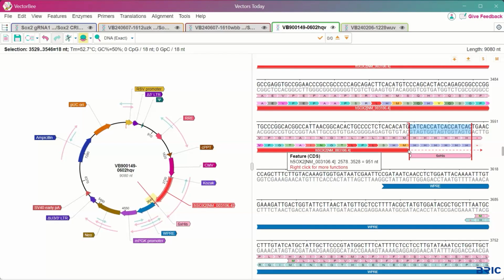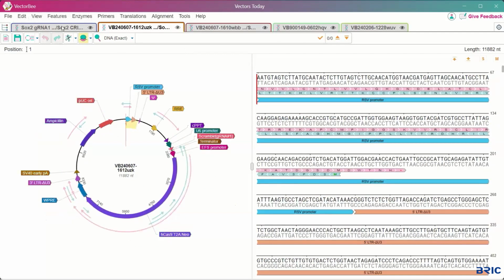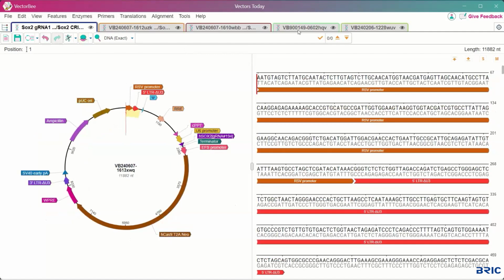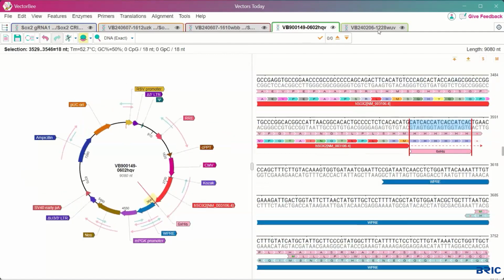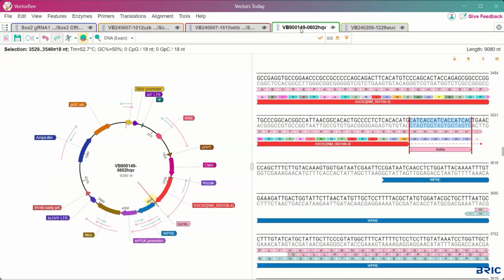Best case scenario, you start looking at your various different restriction enzymes that you have in the lab. You also start to download hours and hours of podcasts because you need something to keep you company while you sort through all of these different vectors and try to figure out how you're going to combine them or run PCRs to get the relevant sequence. All of these sometimes simple, but sometimes not, often very finicky cloning approaches.